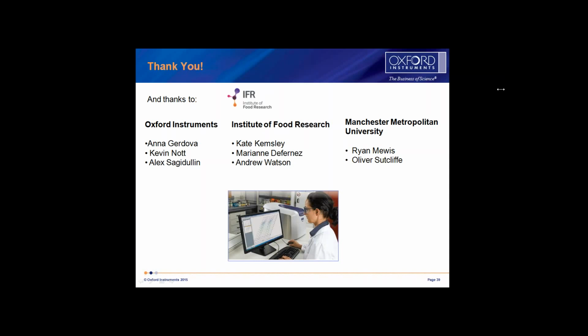So Kate and I will now have a look at some of the questions that have come in, and we'll see what we can answer. The first question: are all of those experiments set up in the instrument by default? All except the newest experiments, which are the 1D selective excitation. They're set up on my instrument and can be set up, but they're not on the instruments as standard. All of the other experiments, plus T1 and T2 relaxation measurements, are available on the system as standard.